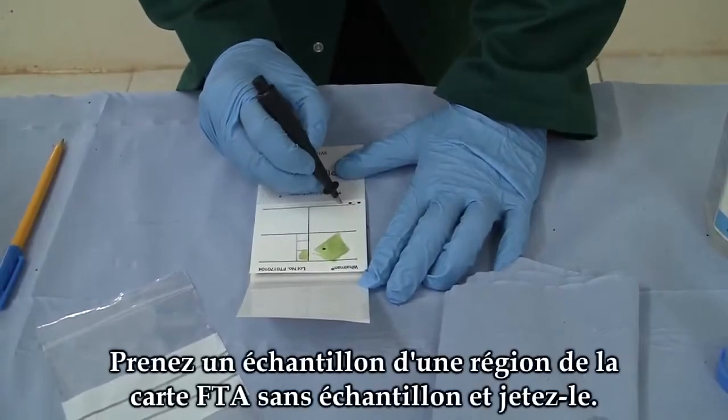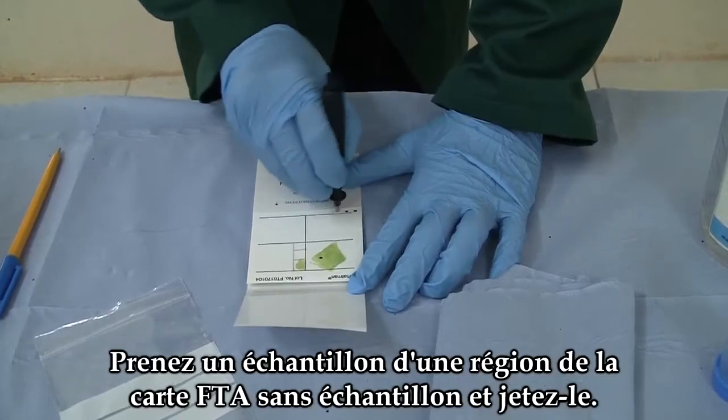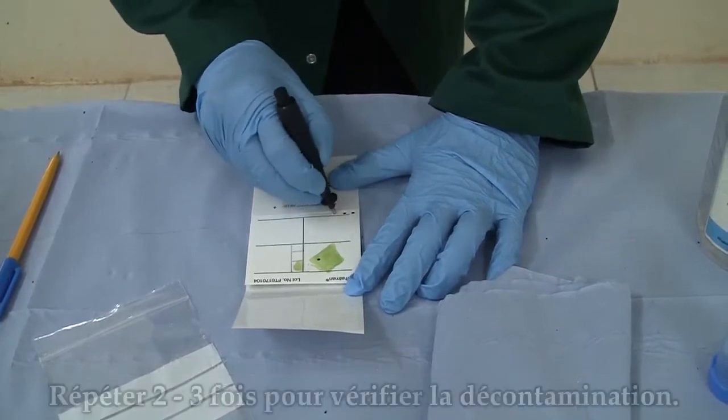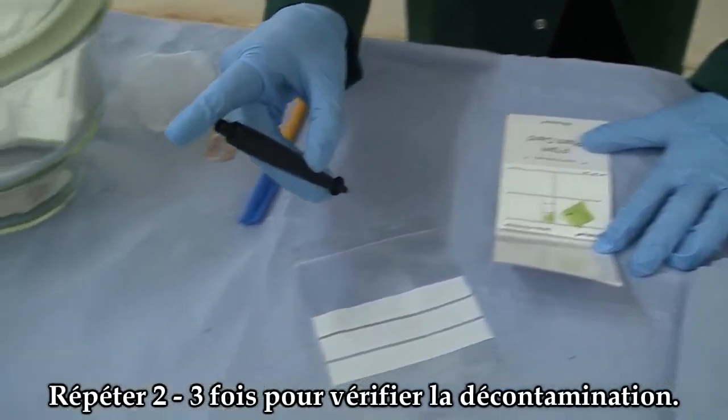Take one punch from an unspotted area of the FTA card between samples and throw it away.